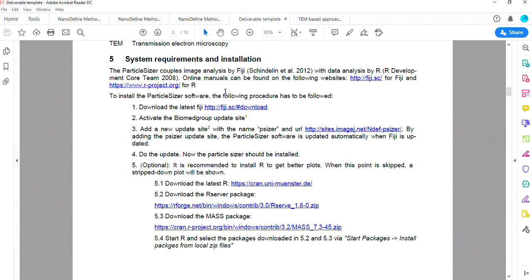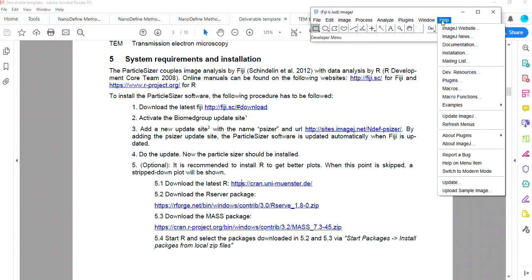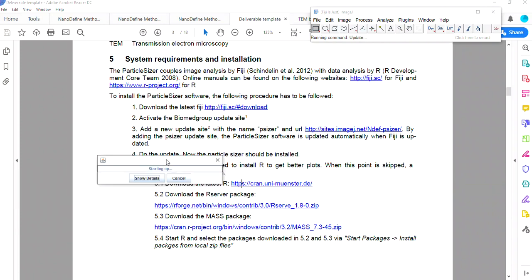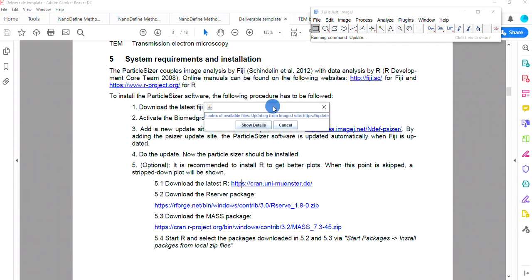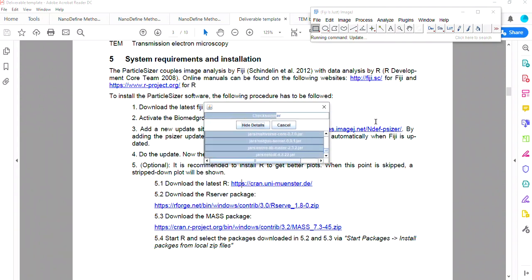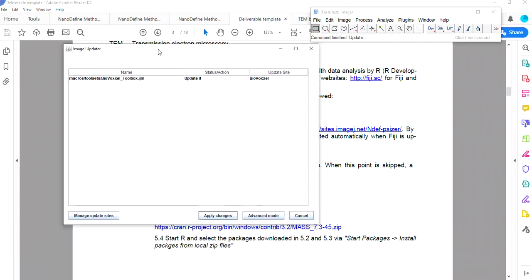So finally, you have all that down. You can open Fiji and you'll need to activate the update sites. Starting up. All the information is here, but I can quickly show you.